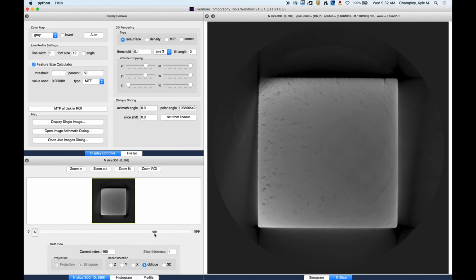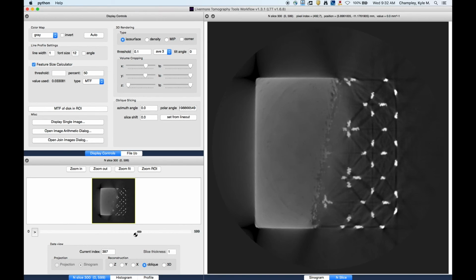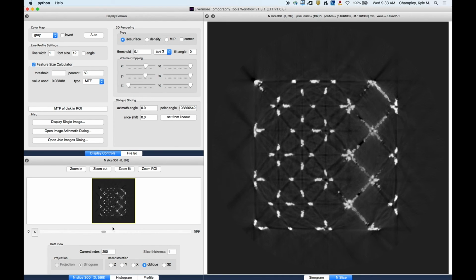And you can see here that we are pretty parallel to it. You can see the plane quickly disappears. So I can view it at any oblique slice that I want.